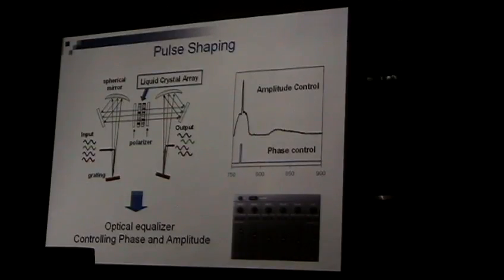This is actually similar to what Ivan used for point tracking. So I also use a liquid crystal display. This is how it works. I'm talking about a femtosecond, very broadband laser. So here I just draw 4 different color waves. Just imagine this one is 750, the other is 800, 850, and 900. Now, what you do is you disperse these spatially by wavelength. So the red one follows this line, green here, and blue here. You just basically spread it, and make them all parallel.